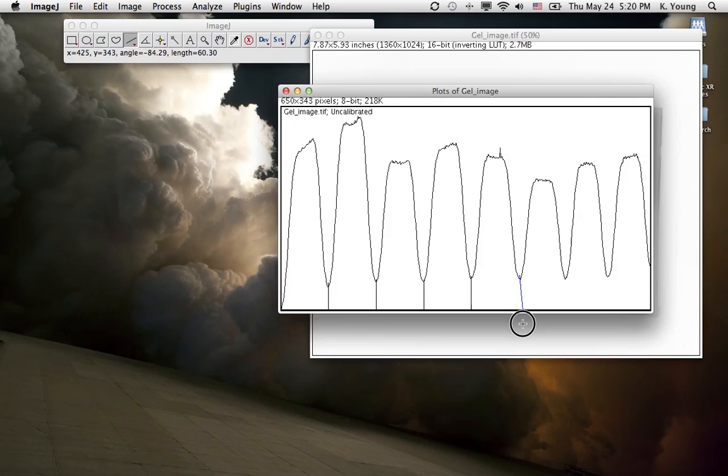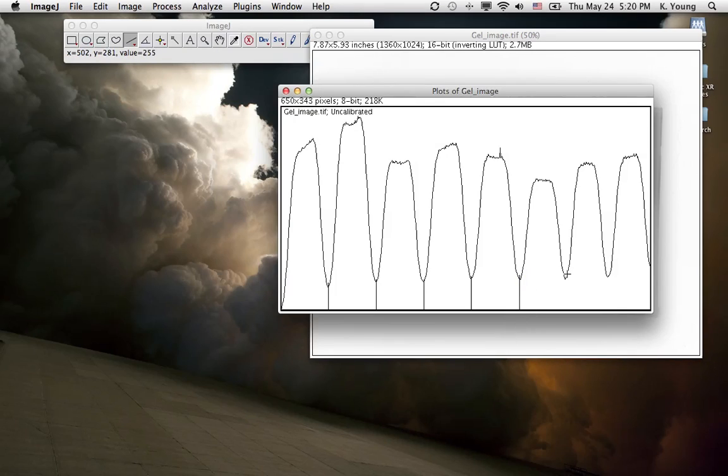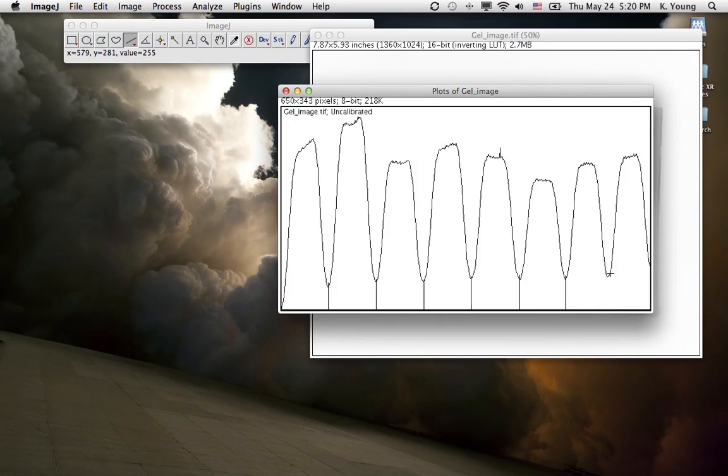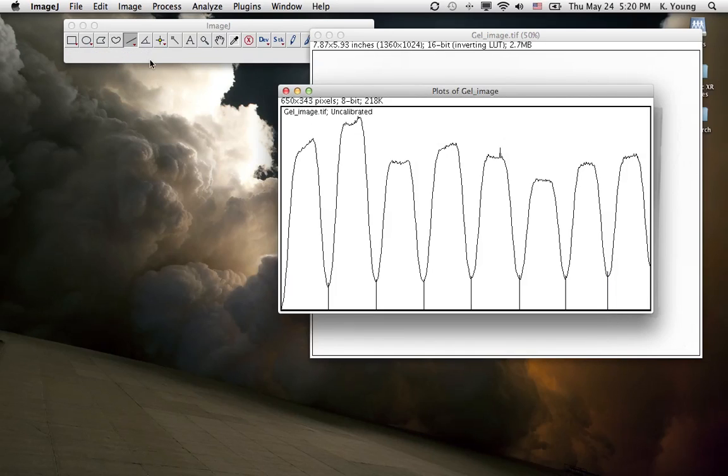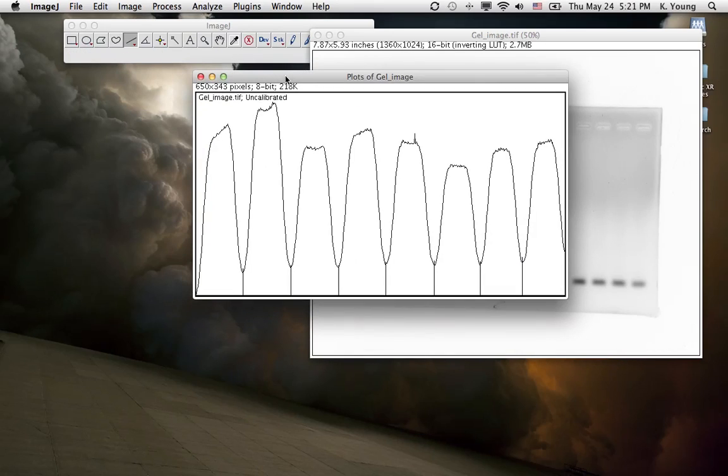So let's get this done. I have 8 bands here, so there's going to be 8 separate peaks. I'm not doing a very good job, but it's good enough.